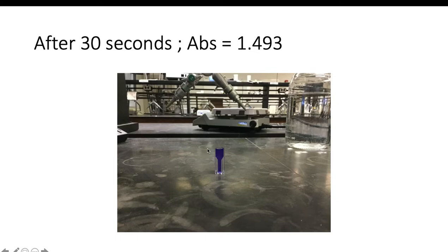We use small plastic containers, what we call cuvettes, to do our reaction in, where we just have our solution in this little plastic container. It's almost like a rectangular prism for its general shape, and we fill our solution in here. The nice thing is we can put this in an instrument that I'll show in a moment that will measure what we call absorbance. If you're wondering what exactly absorbance is, it's a measure of how much light this solution absorbs at a particular wavelength.